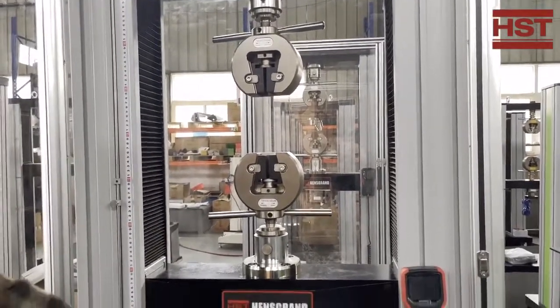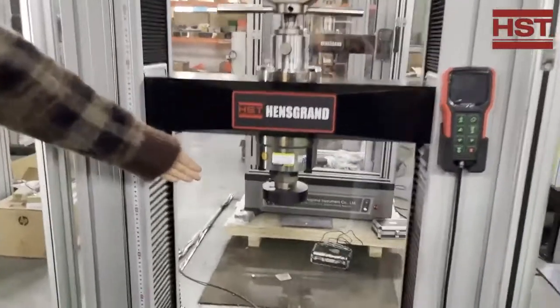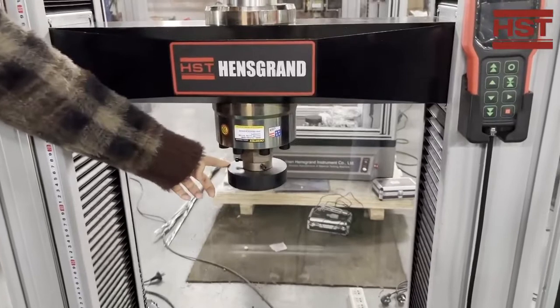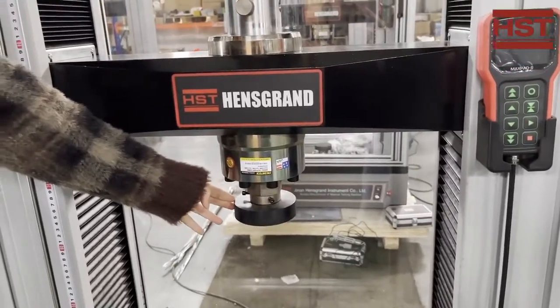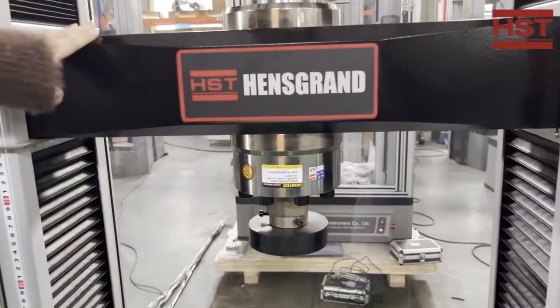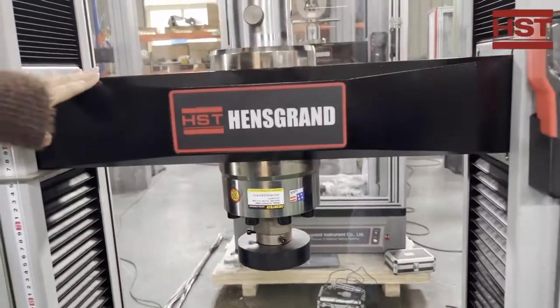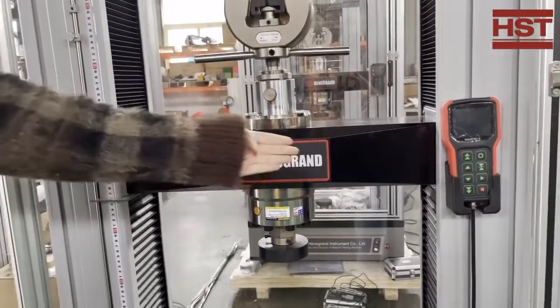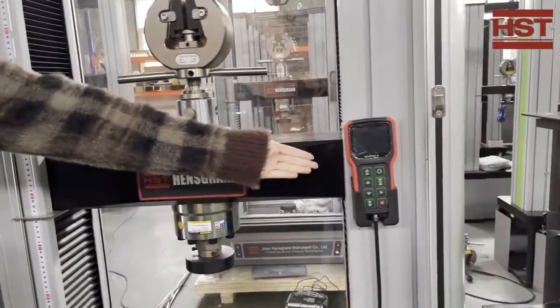The bottom part is for the compression test and it comes with a compression platen. Regularly it will come with a diameter of 100 mm. The middle part is our high stiffness middle beam, which moves up and down.